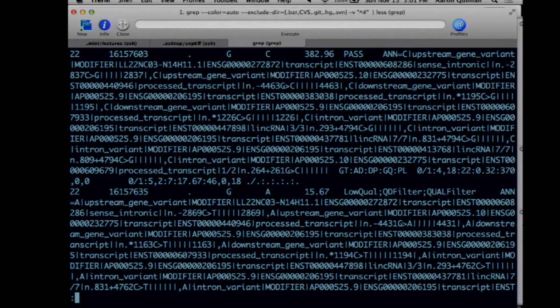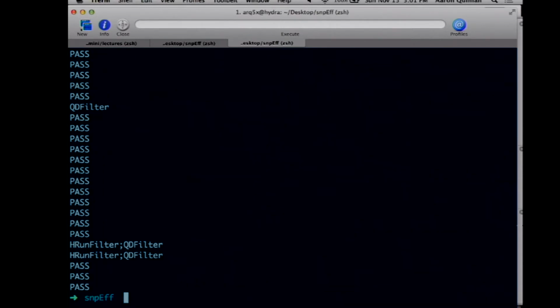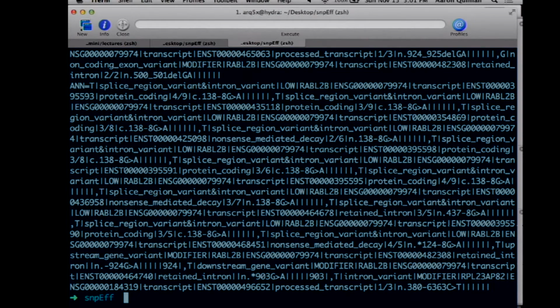Okay, how would we do that? Since it's more than one Ensembl gene ID, but refers to one gene, it's really hard. Are all those in the same column? They are. We may not be able to solve this, but I think we can work on it at least. I forget what number it is. No, 8. So the 8th column is our big crazy info field, right? Can you unique just like E, S, and G star?